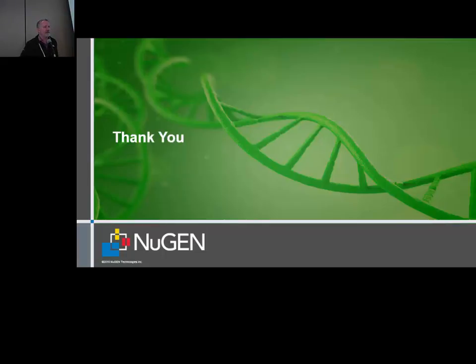Yes? How much can you increase the multiplexing? Because often breeding companies need to genotype 1,000 and 1,000 and 1,000 individuals. They even can sacrifice something about quality if they can increase the number of individuals. Right. Yeah, so we've been talking with customers that want to multiplex up to 3,000 to 4,000, and we have the capacity to make that many barcodes and provide those. We haven't yet had a customer physically ask us to do that, but we can do that, and so we will scale that up as the demand grows. That's not a problem.